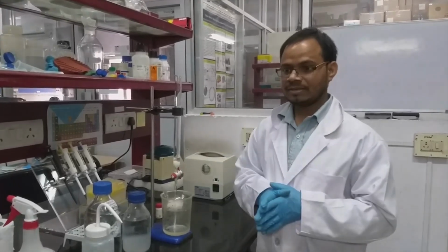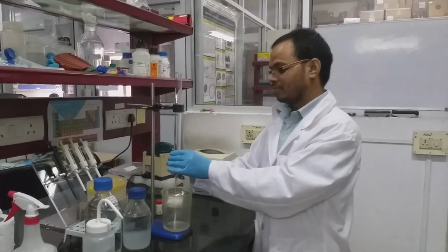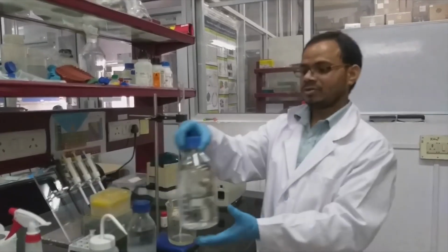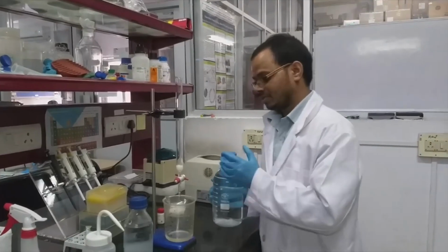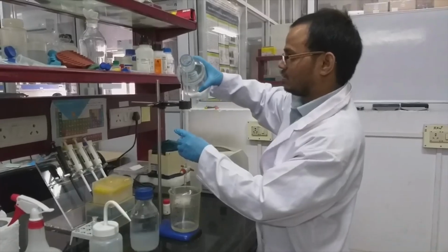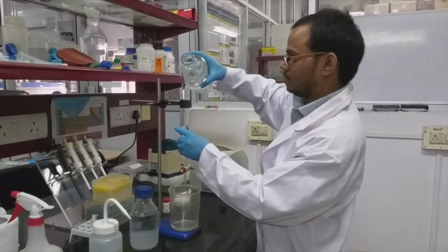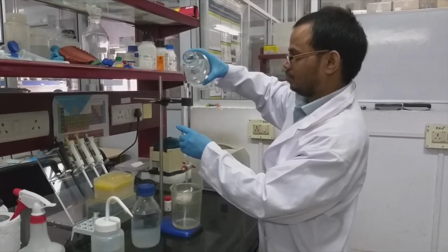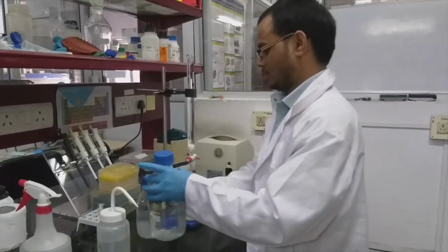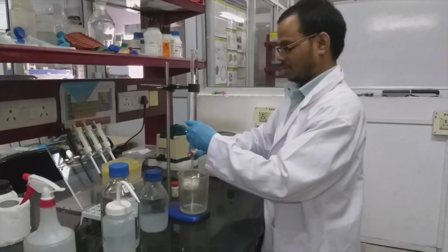So the next thing is we have to add buffer to equilibrate the column. Generally, in all gel filtration experiments we will use 0.05 molar sodium phosphate buffer. So this is already prepared sodium phosphate buffer, pH 7.4. So I will add it like this. I'm going to open the port.